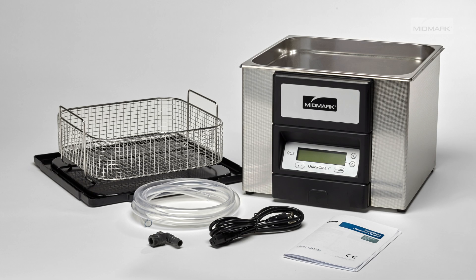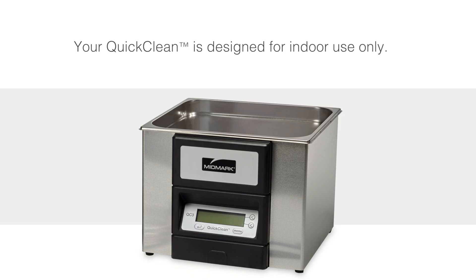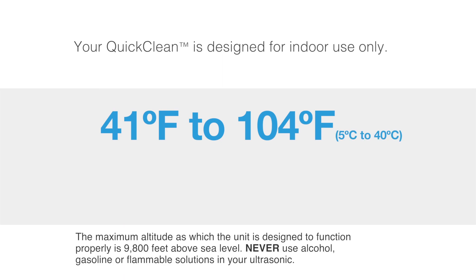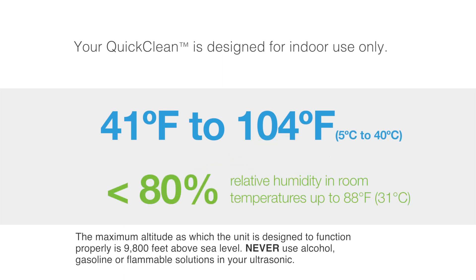Remove the unit and the contents from the box and ensure all parts are enclosed. Your QuickClean is designed for indoor use only. The ultrasonic is designed to operate in an environment where the room temperature is between 41 to 104 degrees Fahrenheit with less than 80 percent relative humidity.